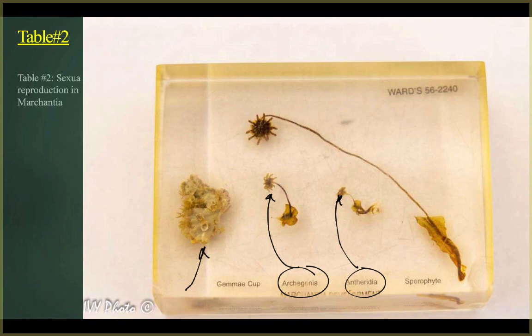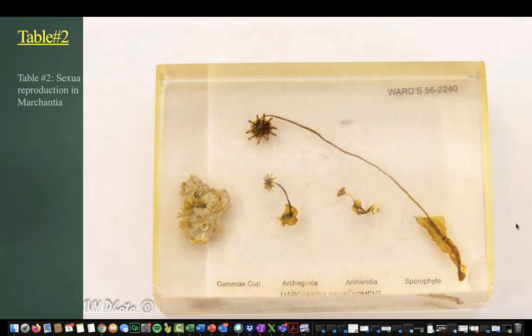And so what they're asking you here is to take these, and you can use this one too. You can use any of these pictures. There's several of them to give you an option. And they ask you to draw the male gametophyte. So one of these two, right, is male and the other is female. And then you should be able to label the thallus, the antheridial head, and the archegonial head and be able to tell which one is which.